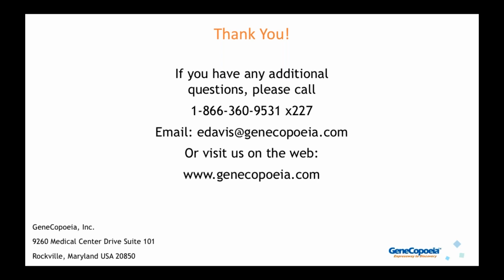Okay, so next question. If I choose to do in vivo projects, should I take all those steps you showed here? The answer is no. Well, the answer is some of the steps, yes, but some no. In vivo work actually does require a different type of screening workflow. But if you want to contact me, we can talk about that.